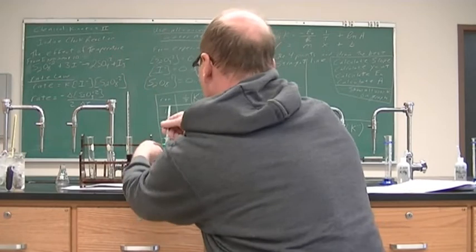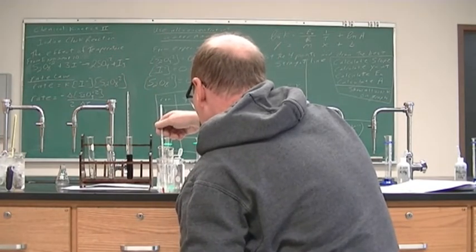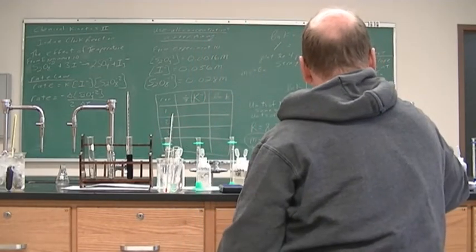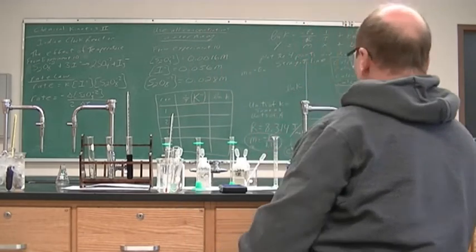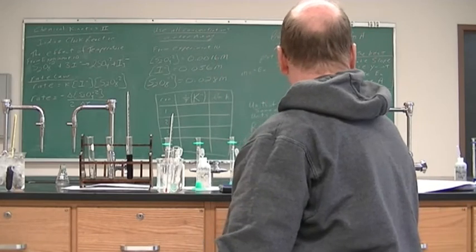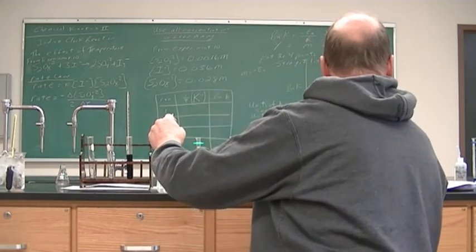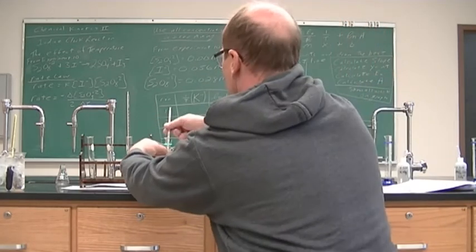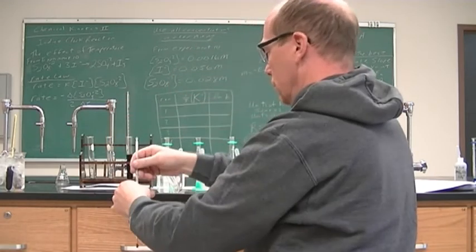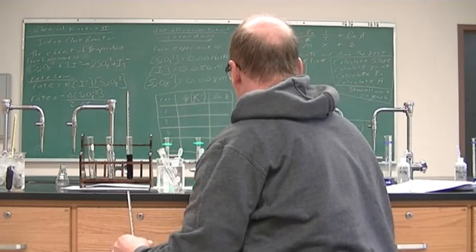Alright, and so now we have our last one, which is the warm water bath, although it's been sitting over there cooling off. It is at 30.9 degrees Celsius. So only about an increase of about 9 instead of 10. But all right, and so we'll start this one. So this is going to be pretty fast.